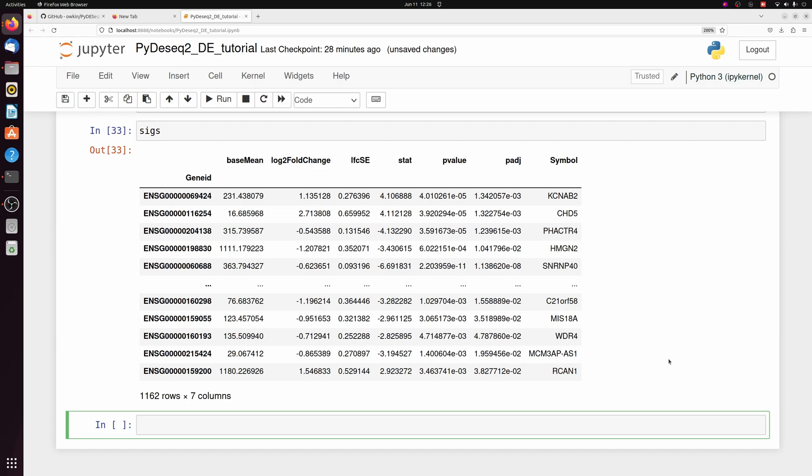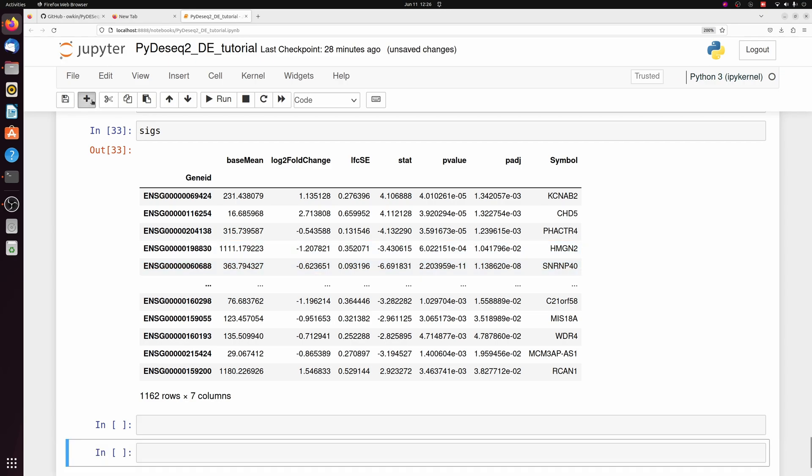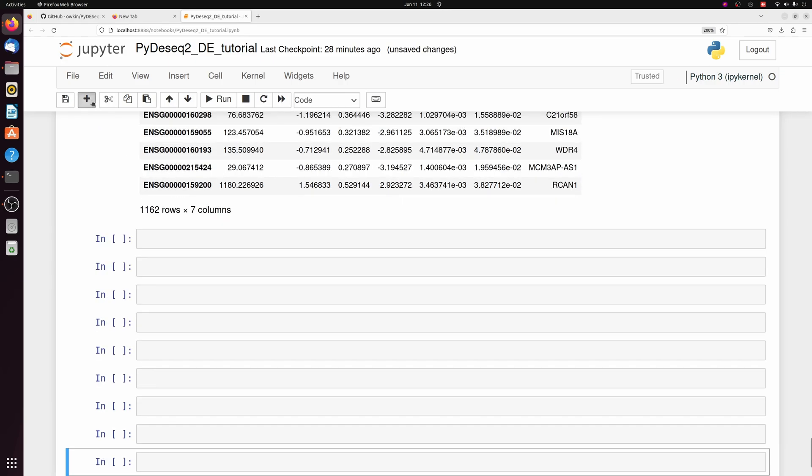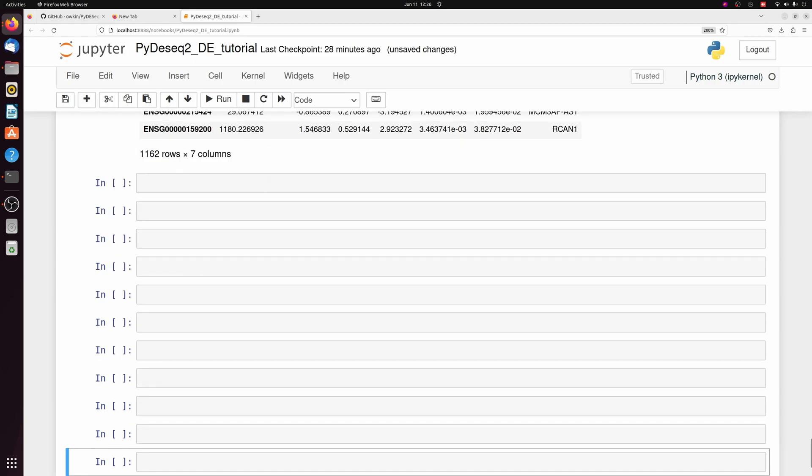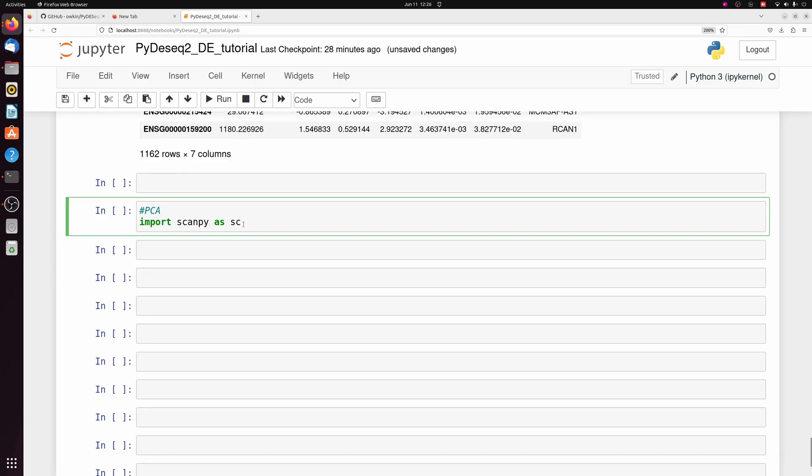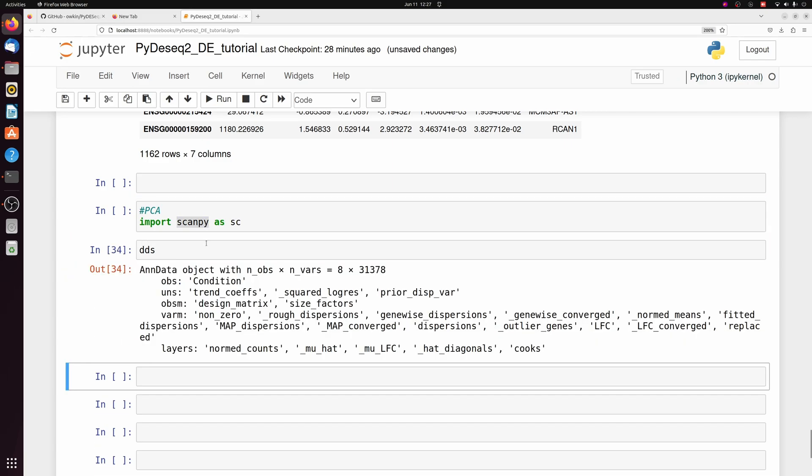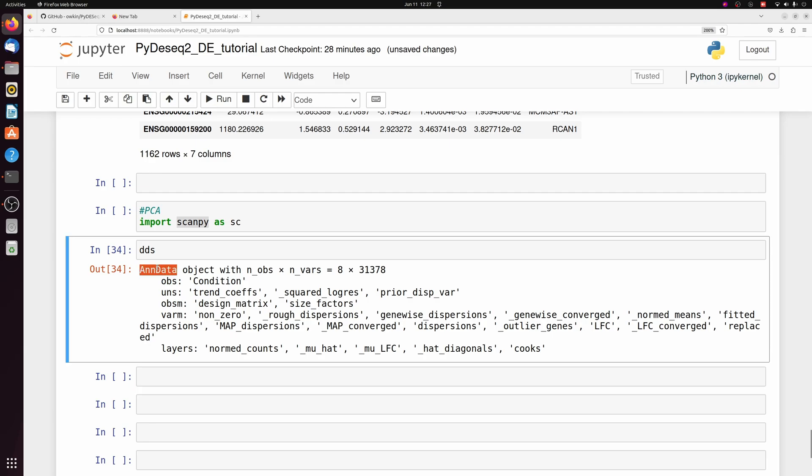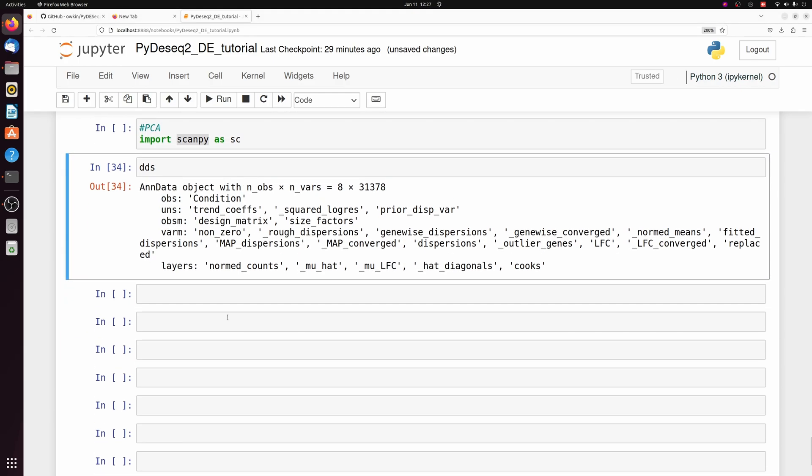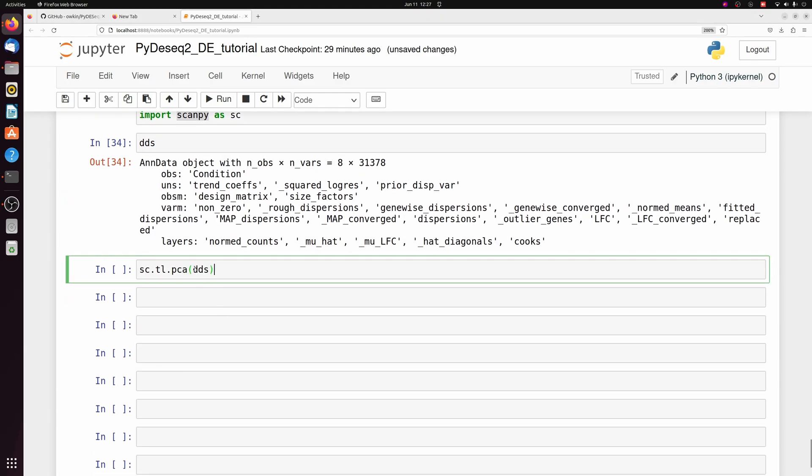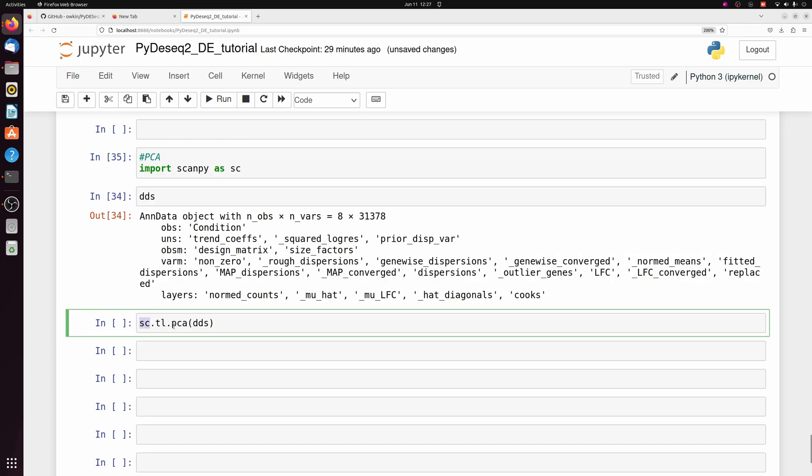I'll go a little bit into the downstream analysis and some of the things we didn't go over, like making a PCA plot, for example. So let's start off by doing a PCA plot here. We're going to be using scanpy actually. So you have to pip install this if you don't have it. Since our DDS object is already an AnnData object, the scanpy package lets us easily do this.